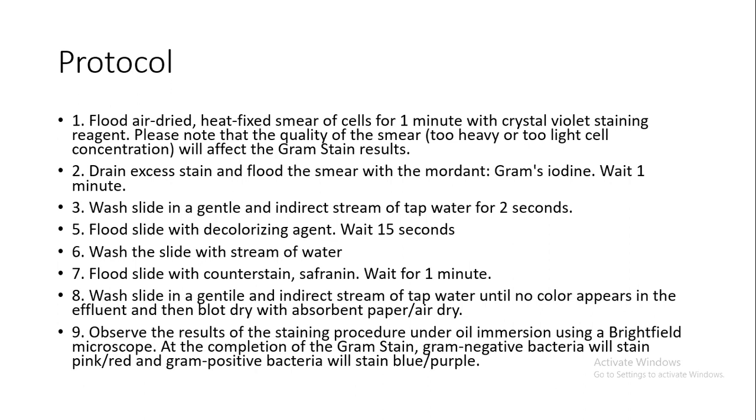The slide is again washed under a gentle stream of water until no color comes out of the slide. Then we blot dry or air dry the slide, and using a drop of oil, we can observe the slide under the oil immersion lens, that is under 100x magnification.